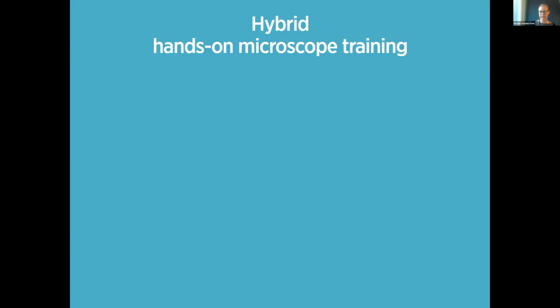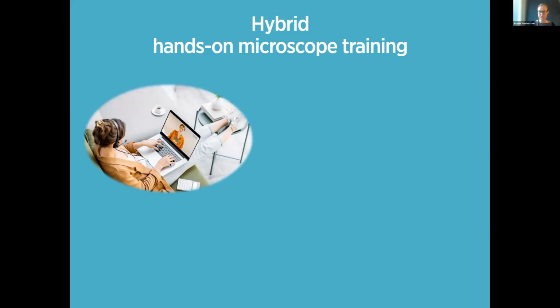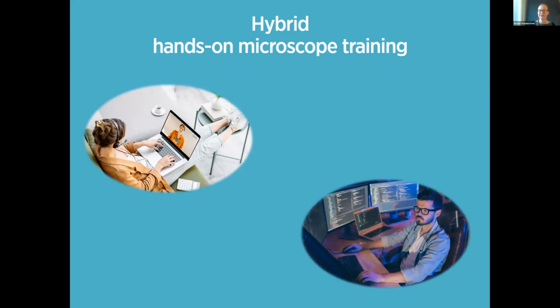And then when we felt they were comfortable, we would leave them. I would go to my office, sit there very comfortably, and let the users themselves sweat at the microscope. And then I would guide them online through the software, in Zoom, with a pen, painting where they would have to click, and the user would be the one operating the microscope.